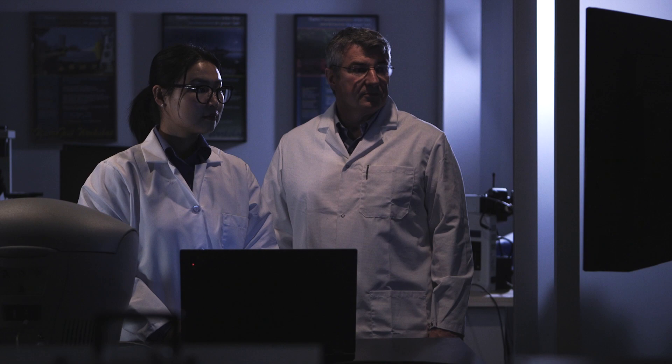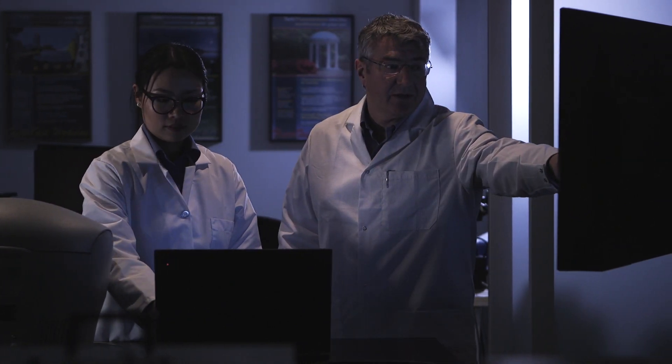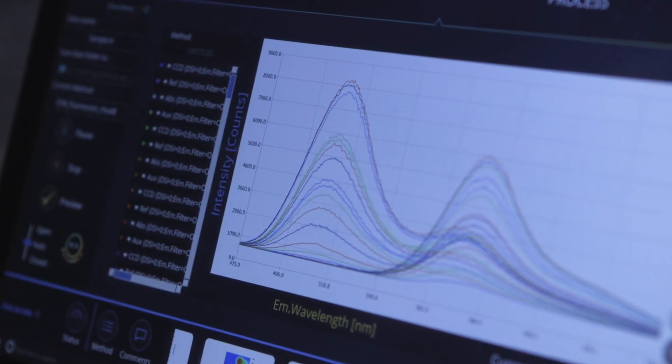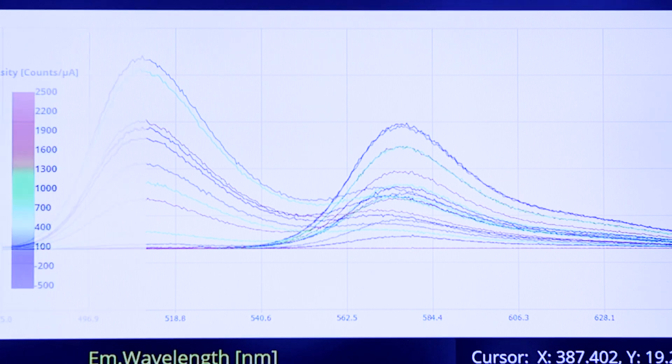The speed of DUETA allows you to collect many more samples in a particular day. DUETA can do this in less than a minute. It makes it much faster for the lab.